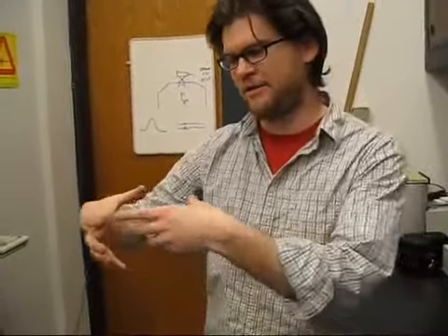What we're developing in this lab is the ability to do that and also make it available to academic research. We plan to take that, package it together, and make it in a way so that hopefully other researchers can take our design and duplicate it in their lab, and from that duplication be able to get the exact same data that we've been getting.